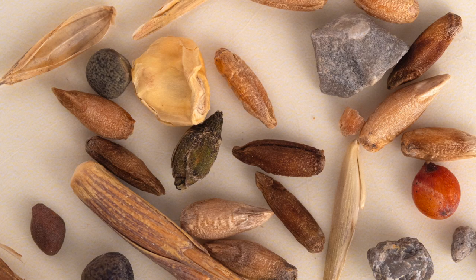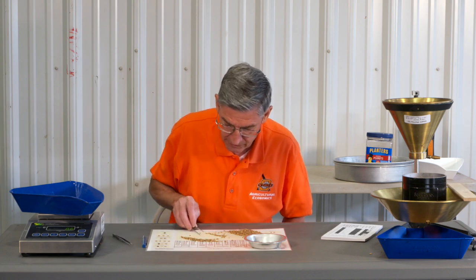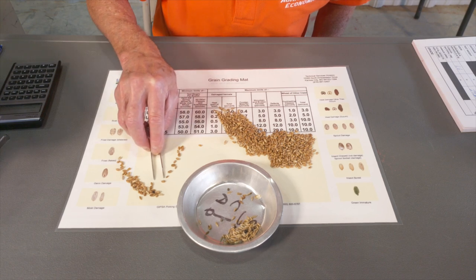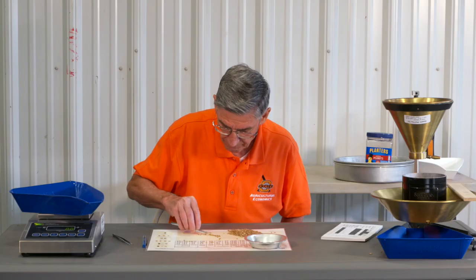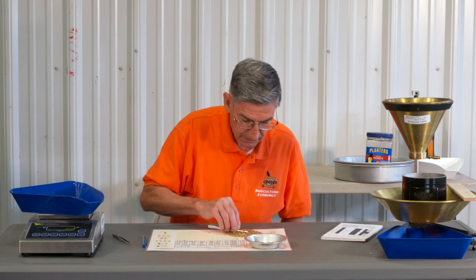As you see those kernels jumping around, that's why you want a sharp point on your pick — so you can get a hold of those kernels relatively easily. I've got a wheat kernel here that's got a husk on it; that's not considered foreign material and you don't take the husk off. This last little line had a lot in it.